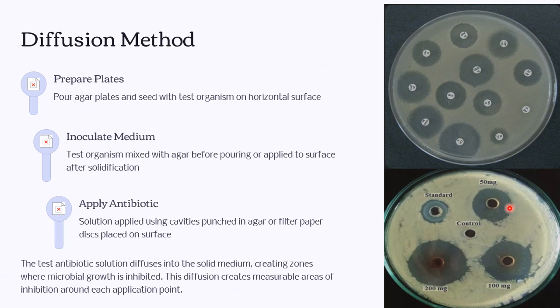Then after the incubation, the inhibition zones are developed, which can be seen around each filter paper or disc or each cavity. The zone of inhibition is seen around the cavities or around the filter paper or disc.